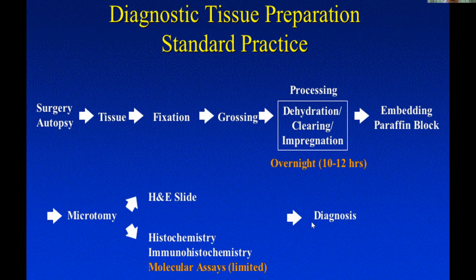Normally the process takes around 4 or 5 days. That's why our turnaround time for urgent biopsy, without any staining or any further immunohistochemistry, is 5 working days, because this includes all the process, right?